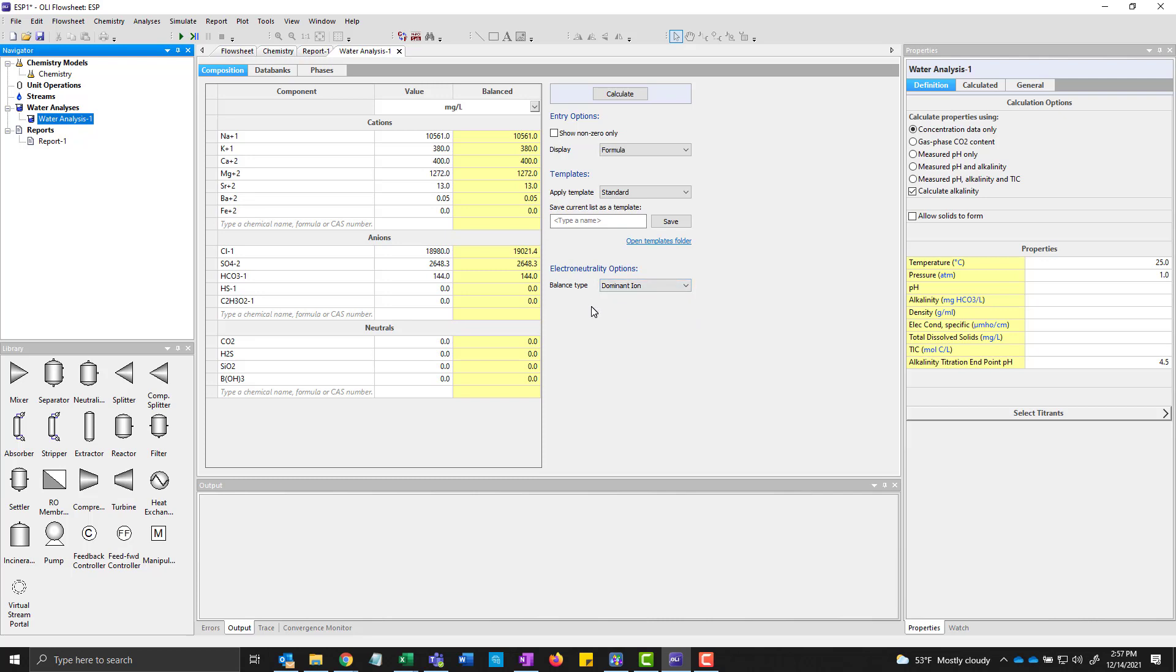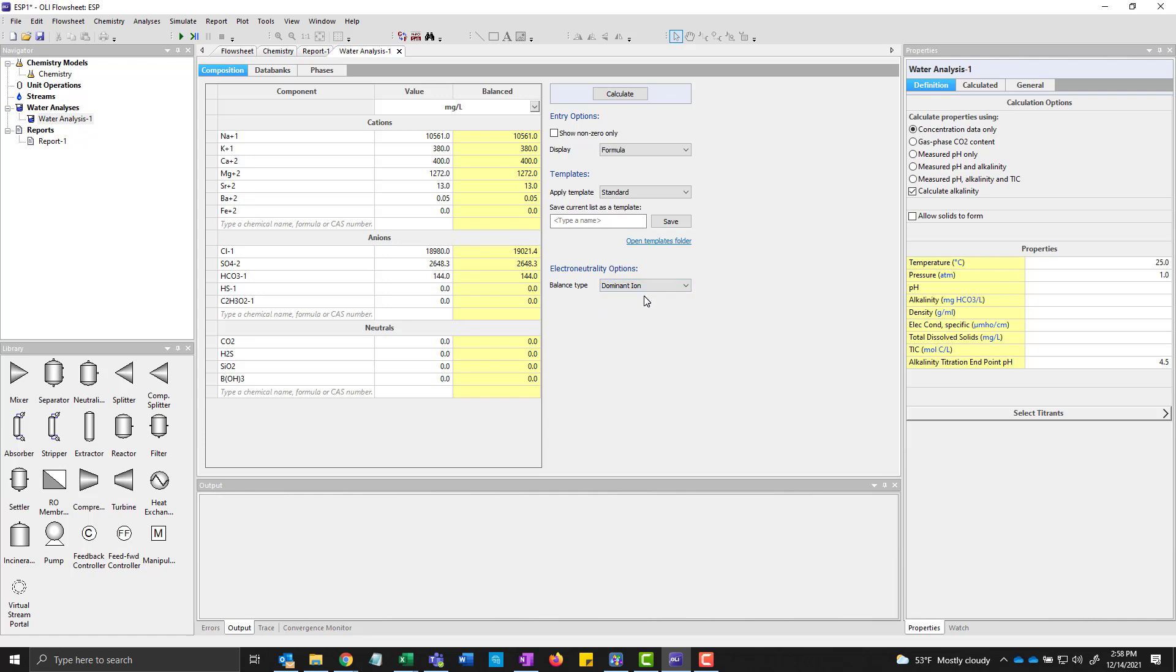Now we have to tell the program how to reconcile this. There may be a net difference in positive and negative charges here. So we're going to pick our dominant ion method to reconcile this. So if there's too much positive charge it picks the biggest negative charge and so forth. And you can see it's actually already balancing it.